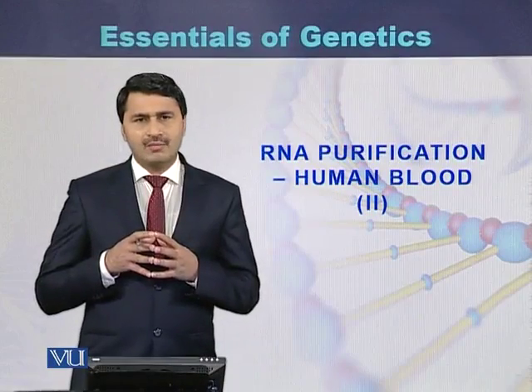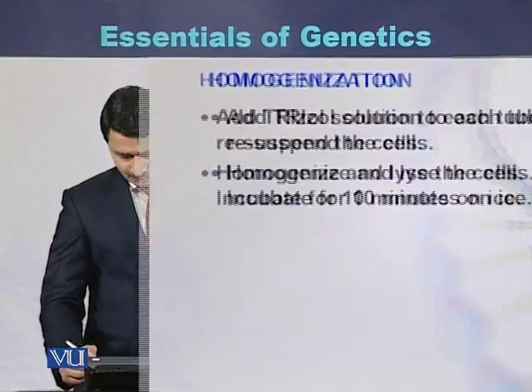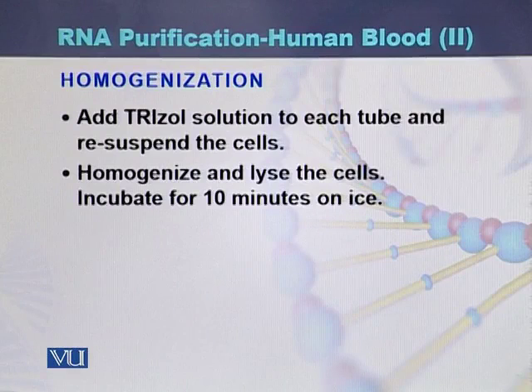RNA purification from blood samples. During the next step, there is homogenization. Once we have got the pellet of the white blood cells, then the next step is the homogenization.